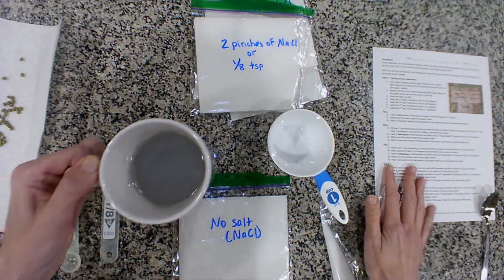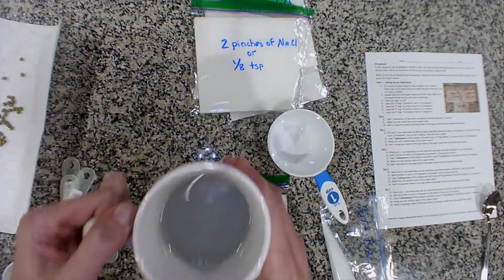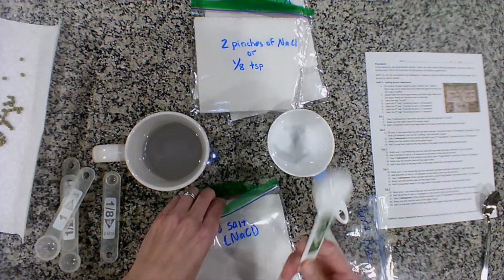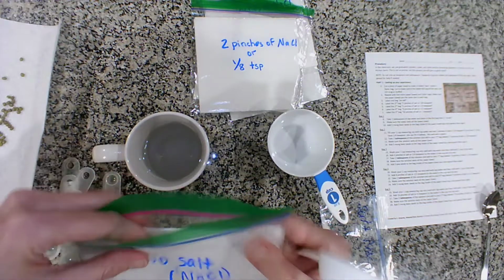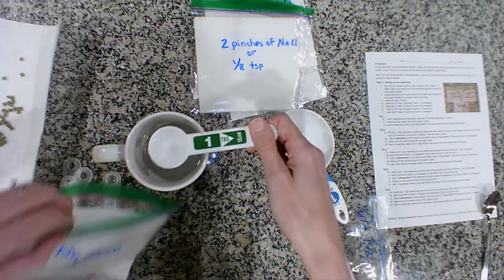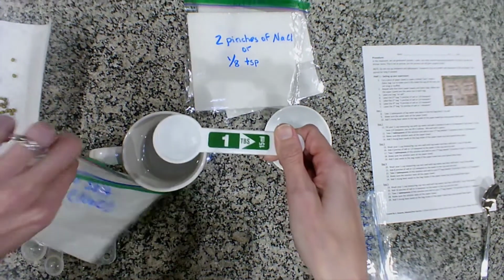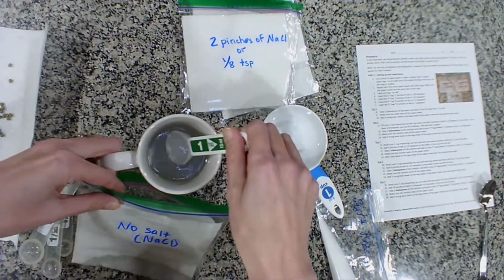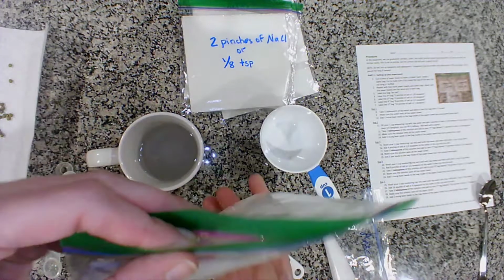All right, so if we're looking at bag 1, it says take 2 tablespoons of tap water and place it in the first bag. That is no salt, so we are not going to add any salt to this particular mug. I'm going to take my tablespoon, pick up my no salt bag, and open it just a little bit here. I need to dip it just a little bit. 1 tablespoon. 2 tablespoons.